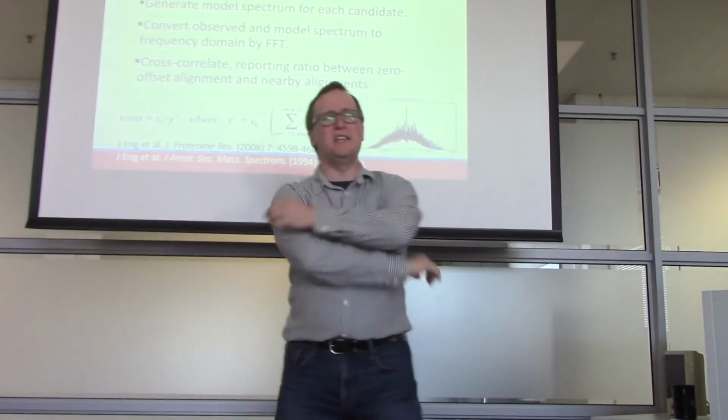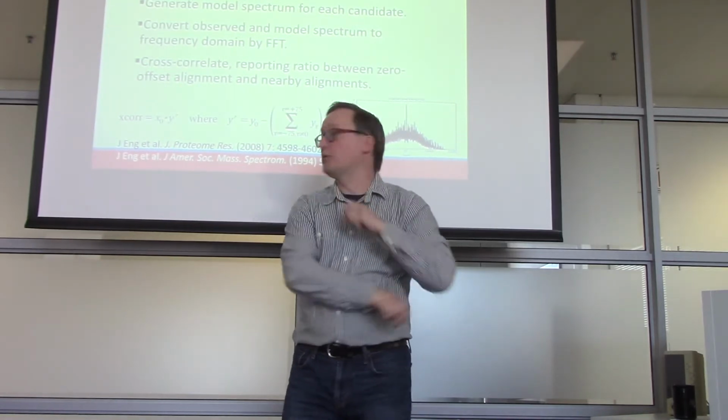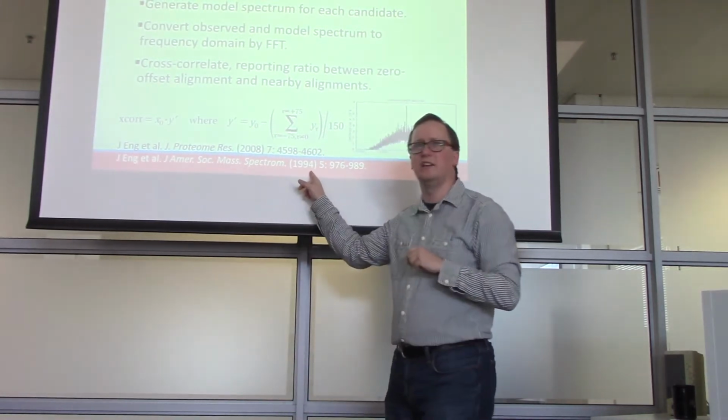Okay, so let's get down to the nitty-gritty. What actually differentiates database search engines? Now we're starting with one that was published back in 1994.